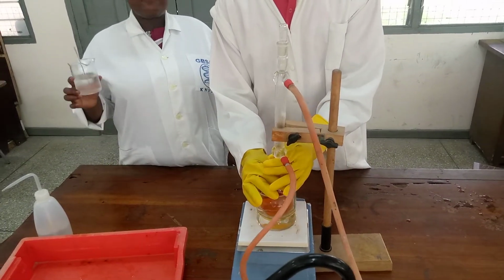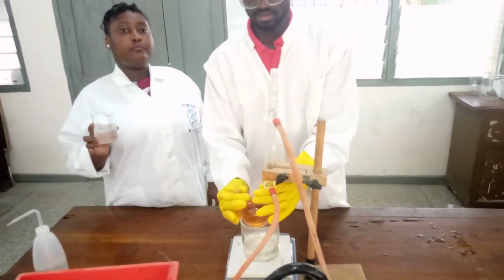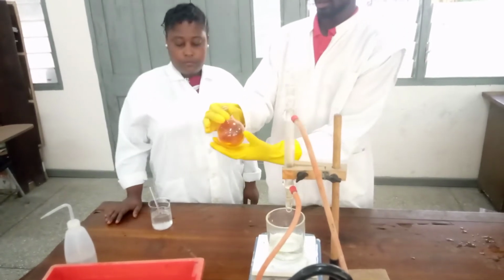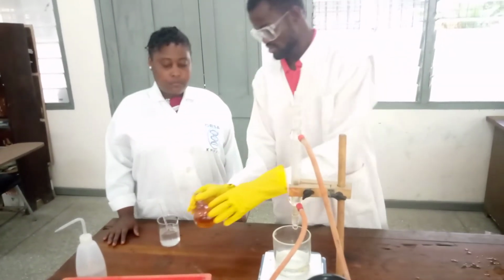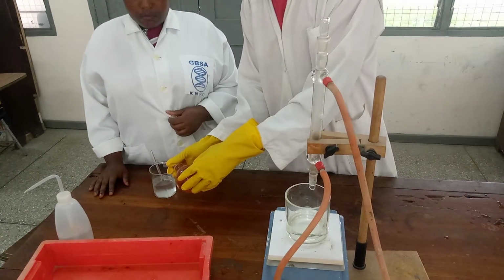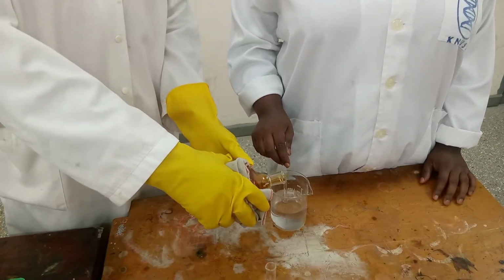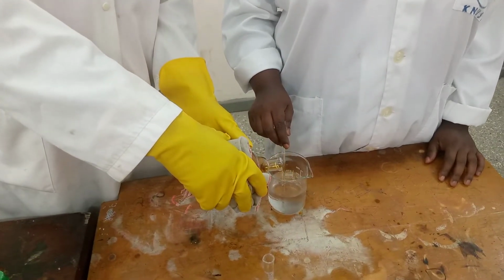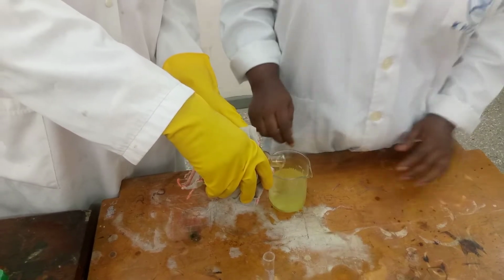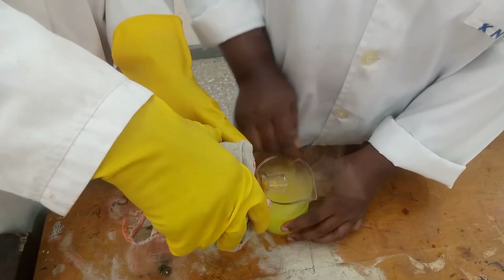This is the ice bath. It contains ice cubes. You gently remove, as you can see, the brownish nature of it. It's very hot, so you carefully pour. As I'm pouring, my rod will be stirring continuously. Dinitrobenzene is a yellowish crystal, so as I'm pouring, she'll be stirring continuously. Wonderful, beautiful crystals under. You can see that.